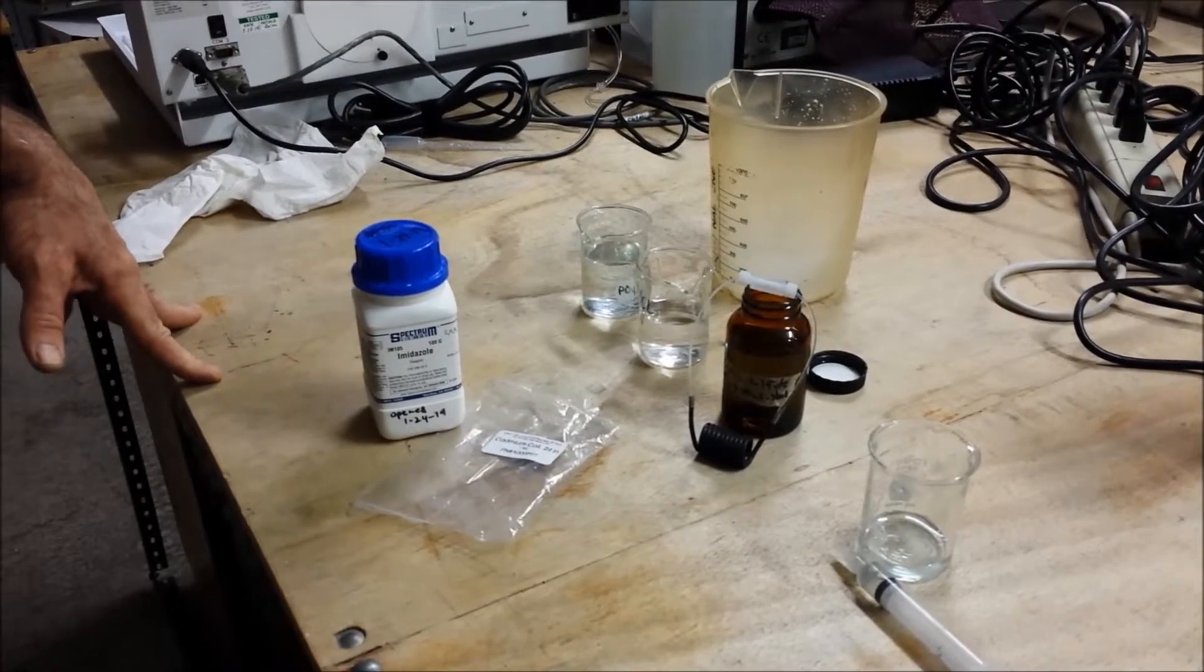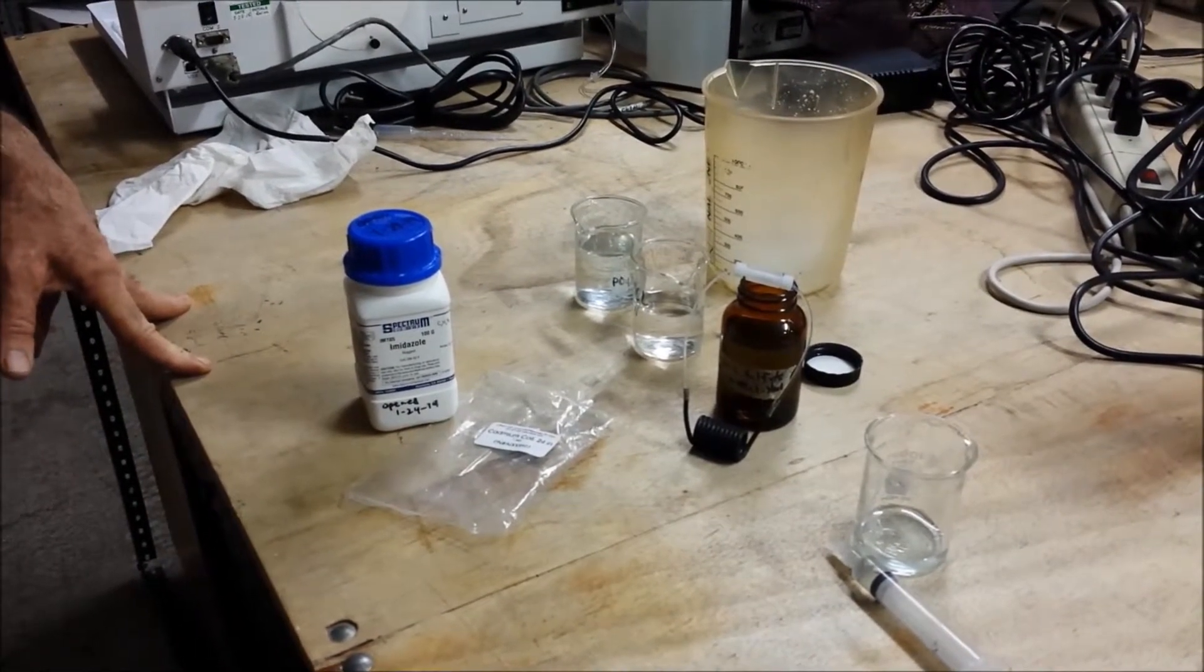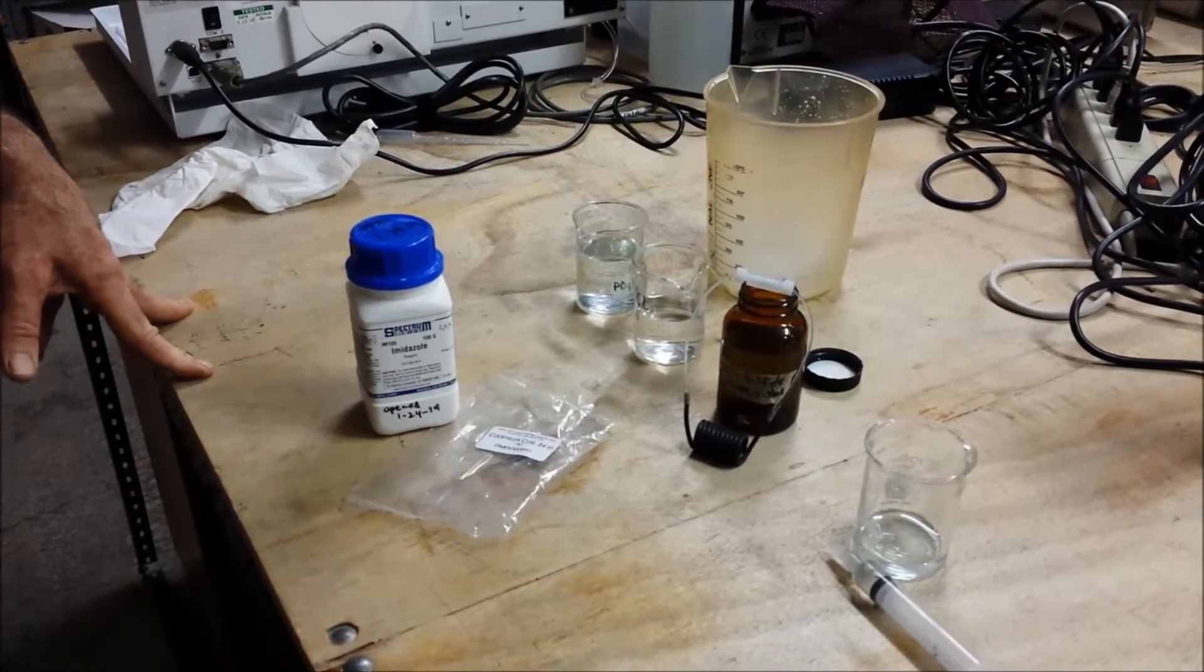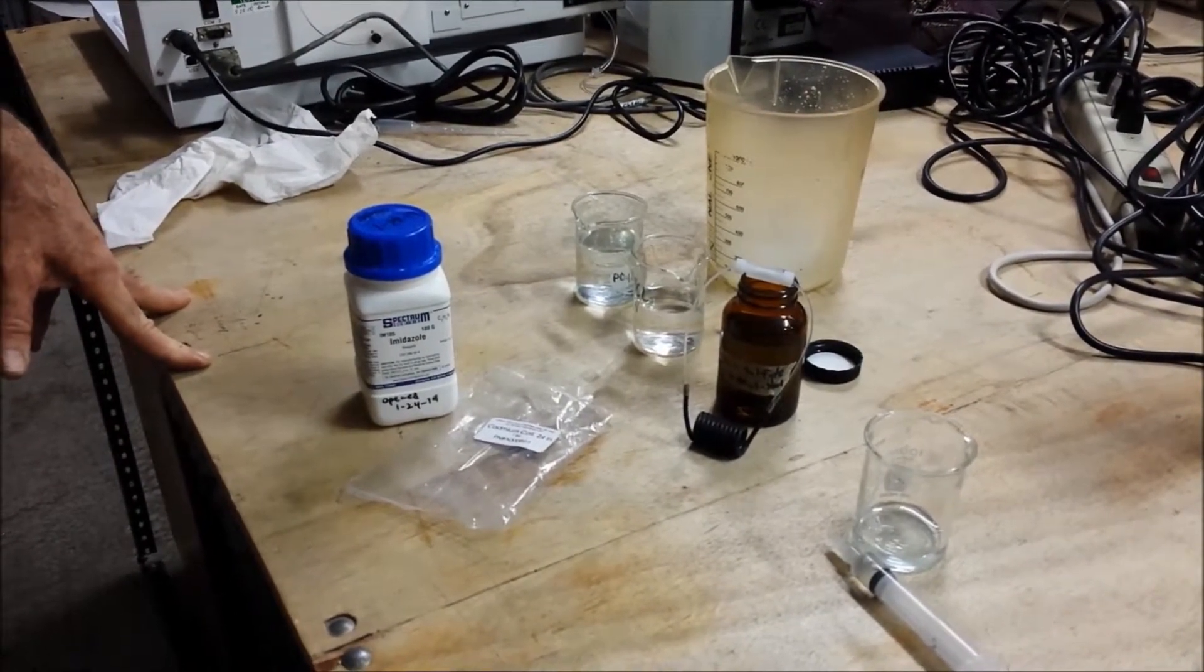You may have to increase the power of your buffer, neutralize your samples, or dilute your samples to see if these effects are mitigated by taking these actions.